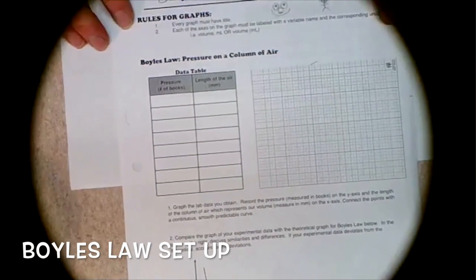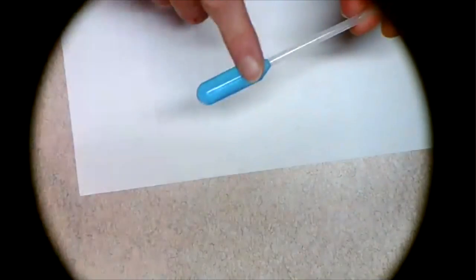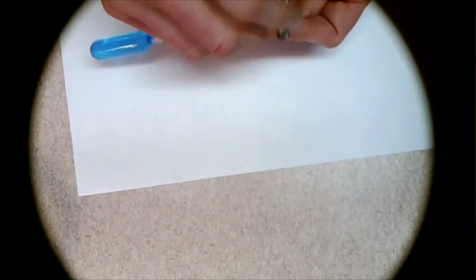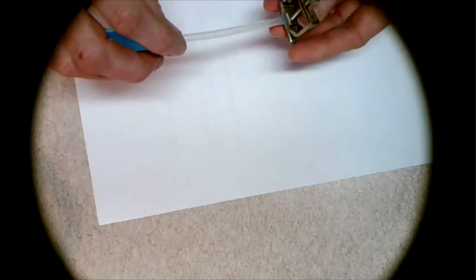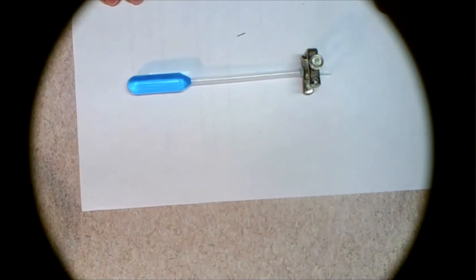This is a very simple lab that you would be doing in class if you were with me. Here I have a simple setup. This is a rubber pipette that has blue water in the bulb, and I trapped air in the stem of it using this thing, which is called a Hoffman's clamp. It clamps down on the end and squeezes it tight so that no air can leak. Hopefully, that's the idea. So there we go, that's our setup.